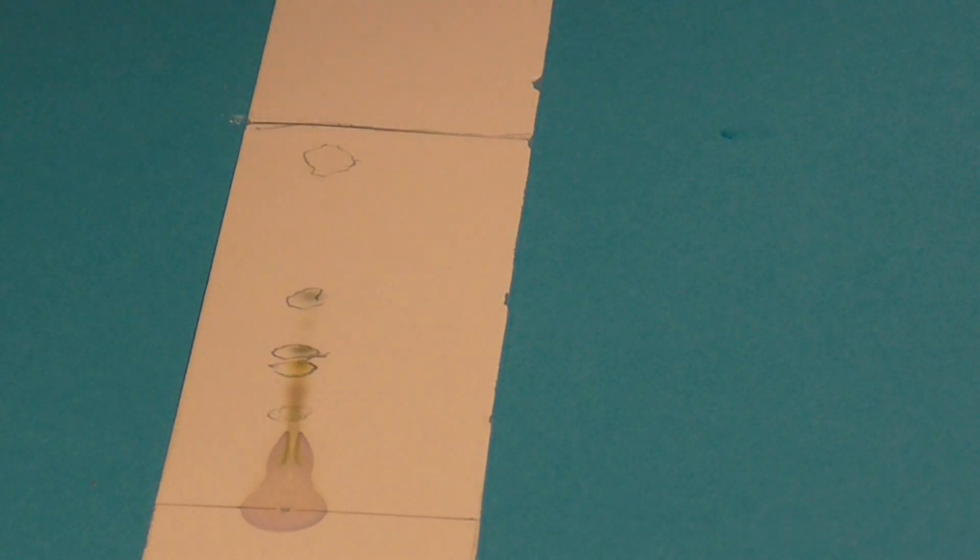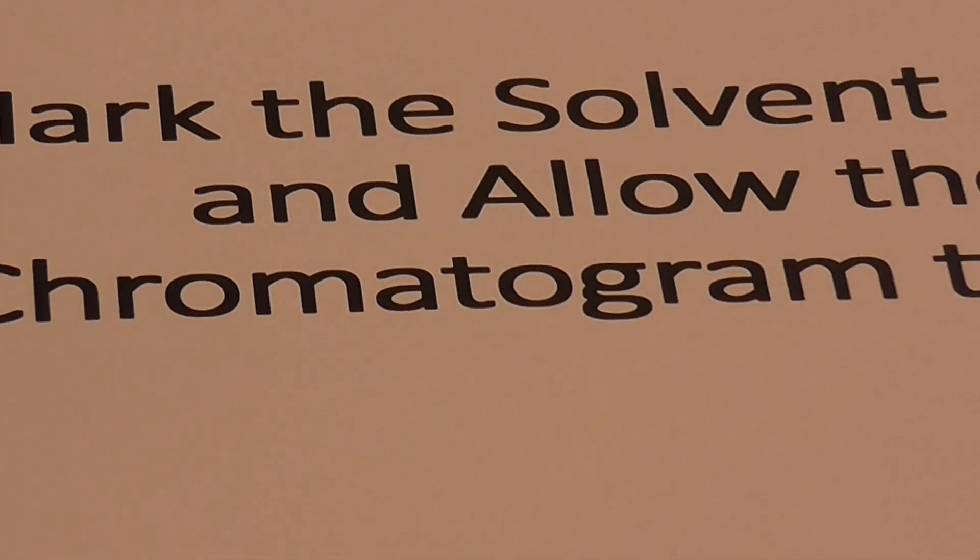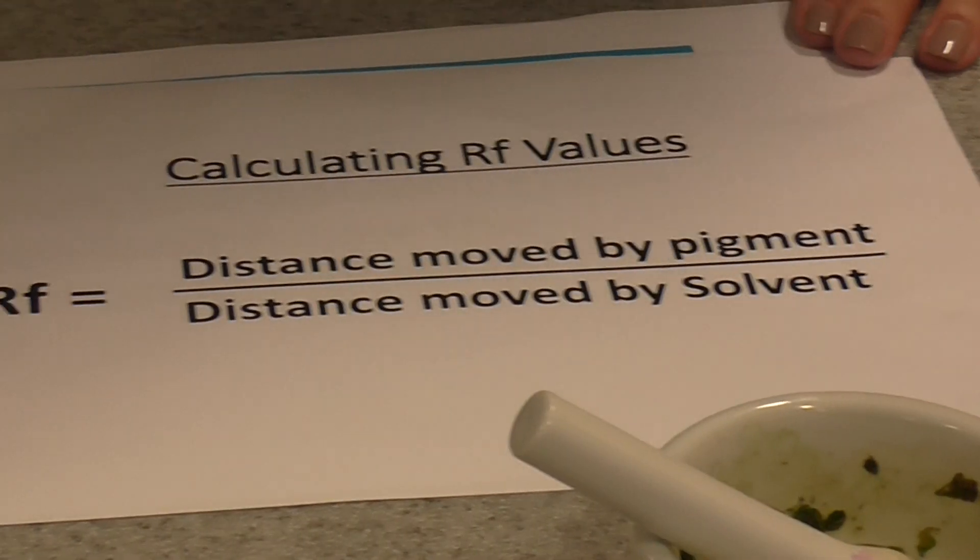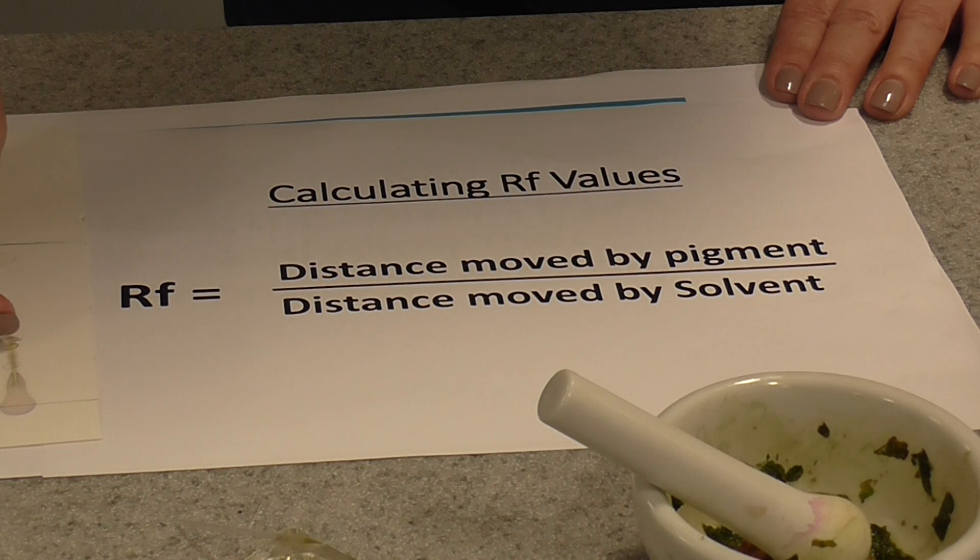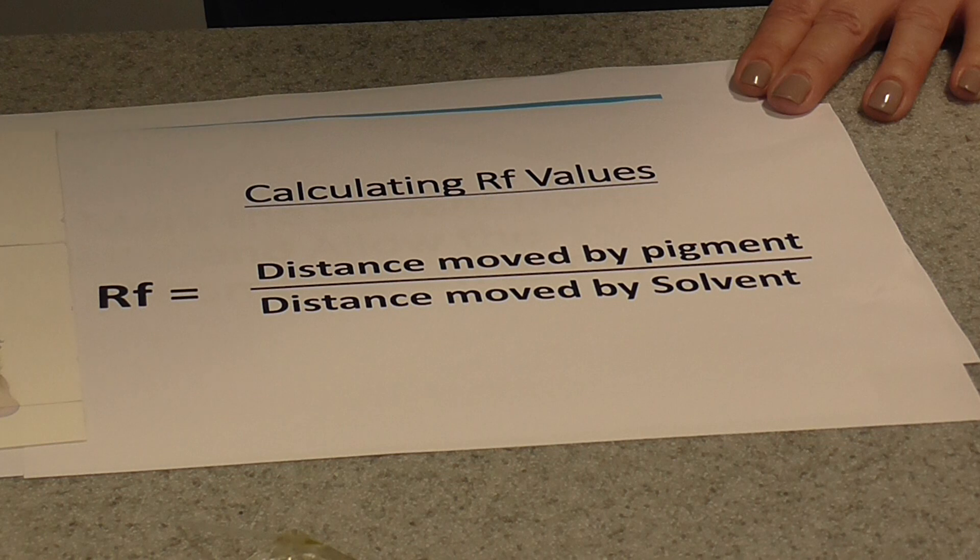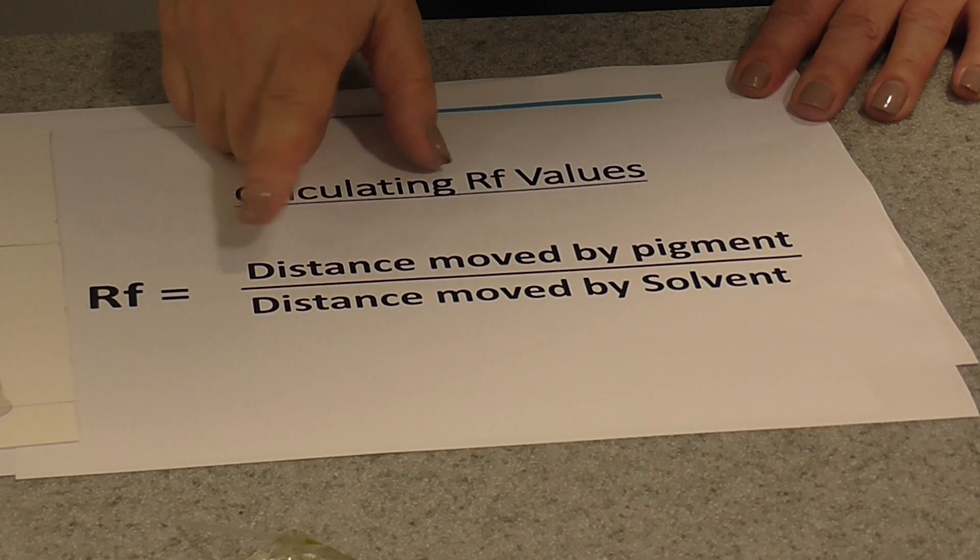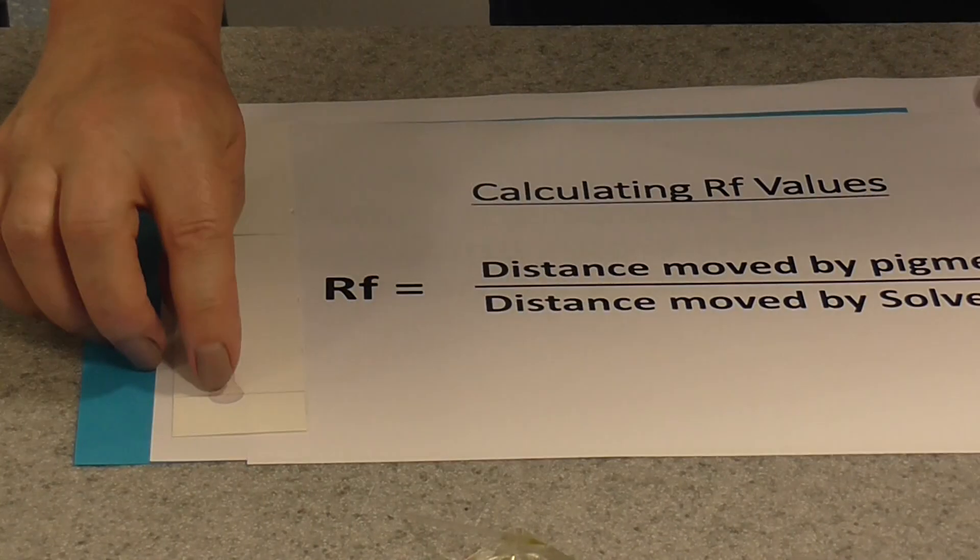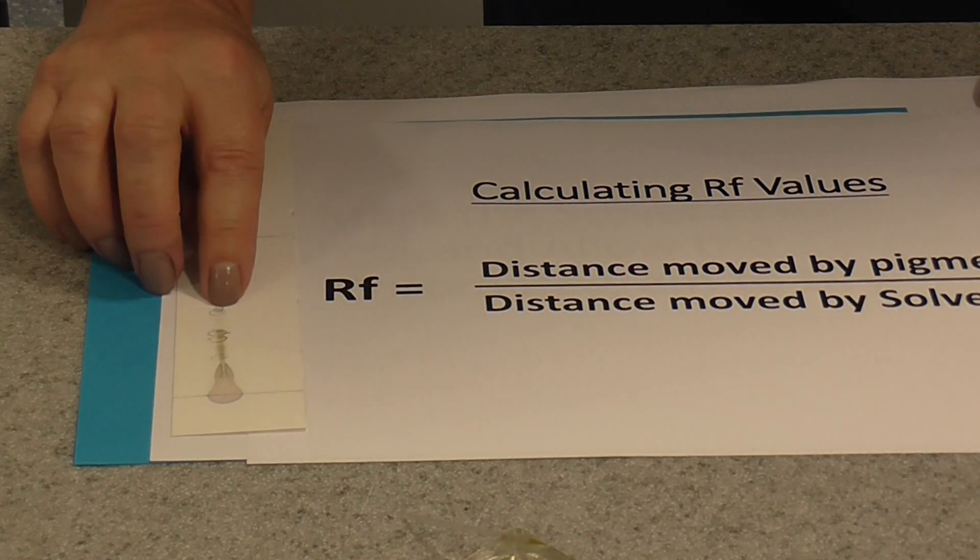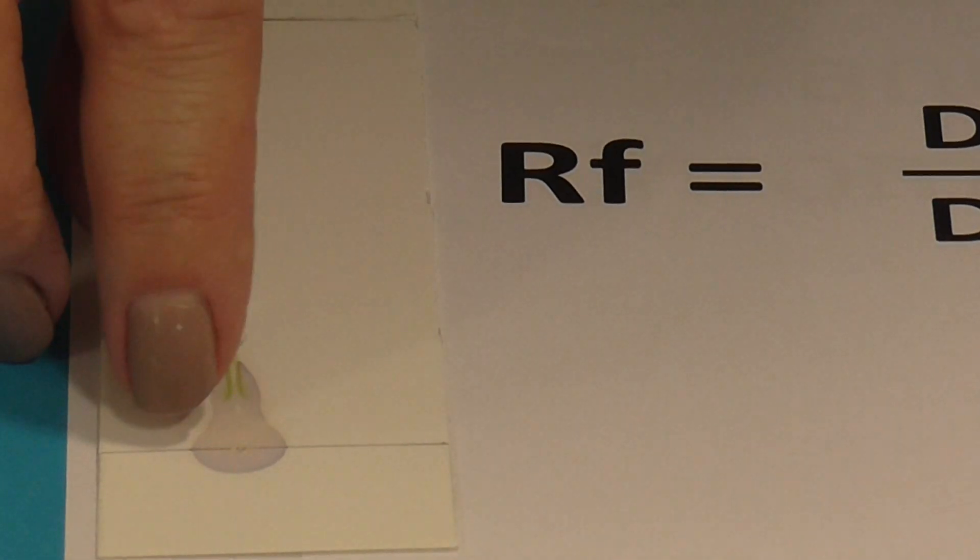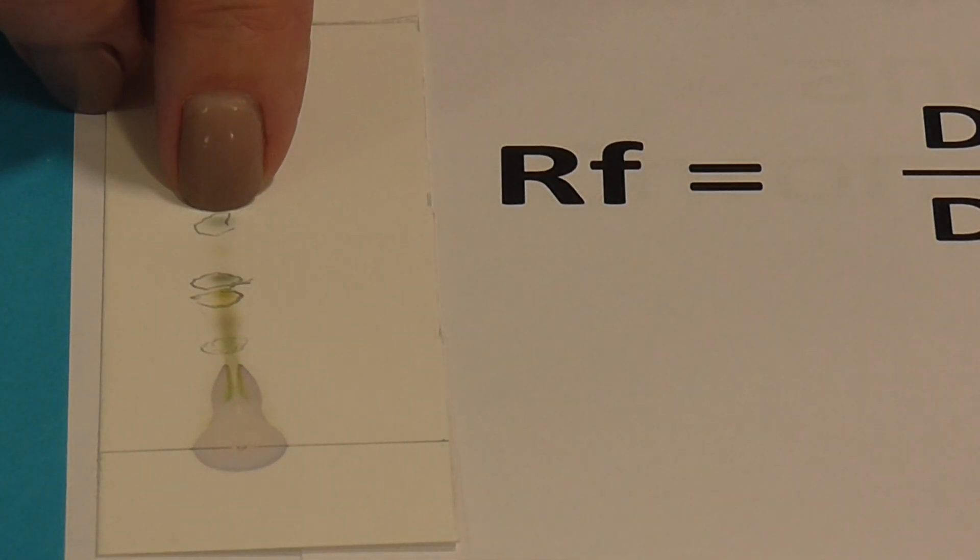Once you've allowed your chromatogram to dry, you can have a look at your spots and work out what they are. To do this, you have to work out an RF value for each patch of pigment on your chromatogram. To work an RF value out, it's very simple. It's the distance moved by the pigment. Get your ruler and measure to the farthest end of each pigment spot. We've got a kind of grey colored spot there. I would measure from the origin line where the pigment was applied at the beginning to the far end of the pigment spot.